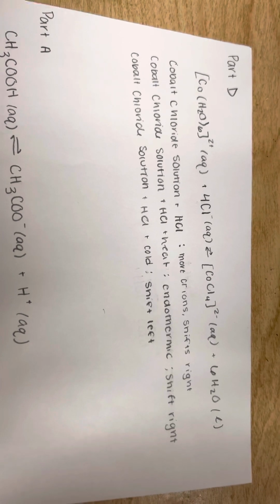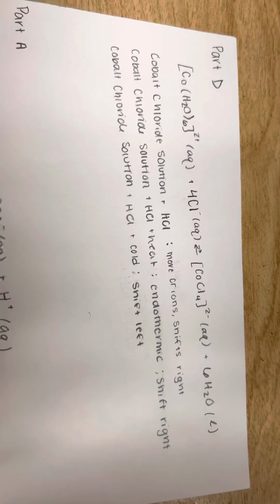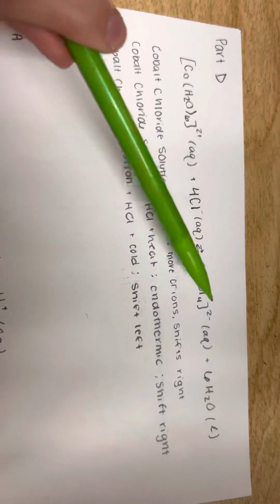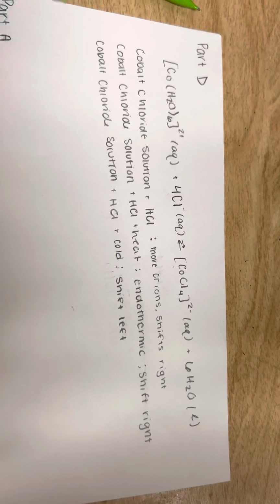This therefore creates a more purple color, so you can tell that the equilibrium is shifted right because of an increase of the CoCl4 2-, which is the blue color. You can tell because the color is changing towards that.